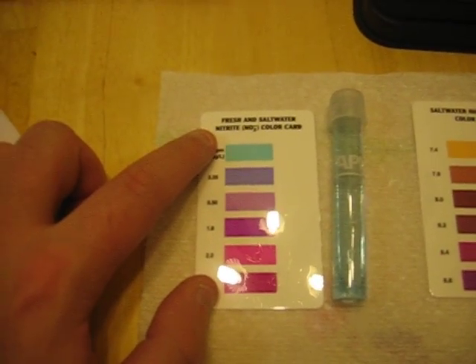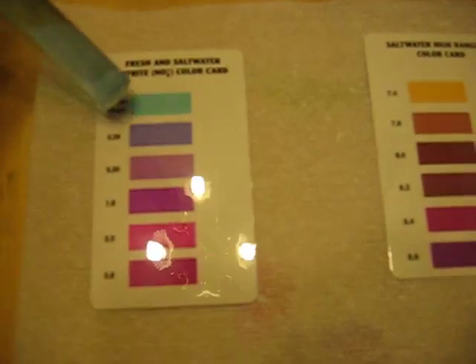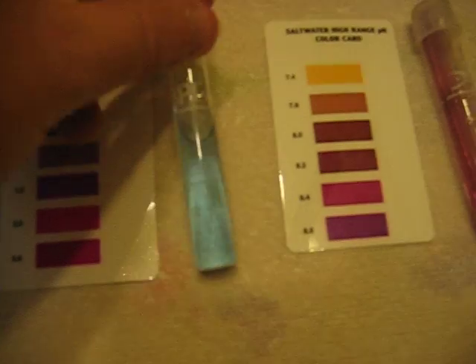So anyway, we have the nitrite right here. Pretty much looks like the top blue, which is zero parts per million.